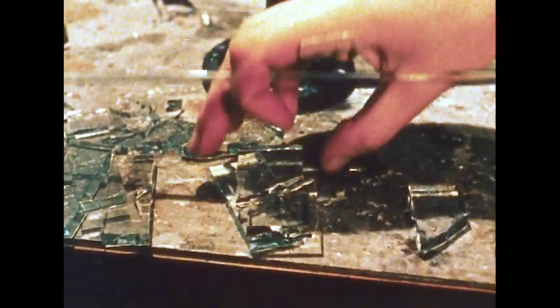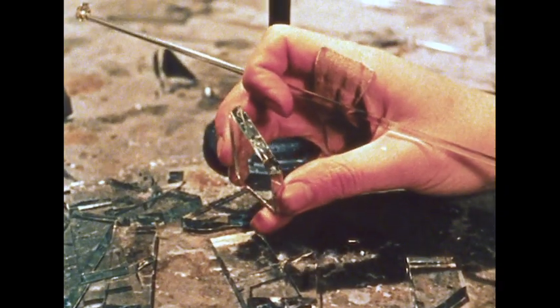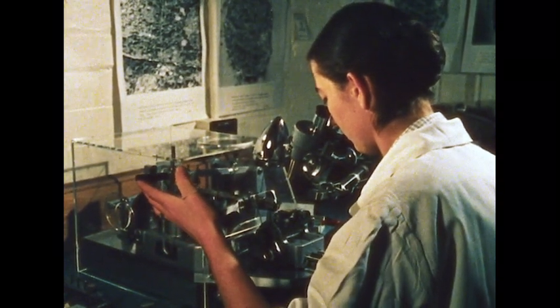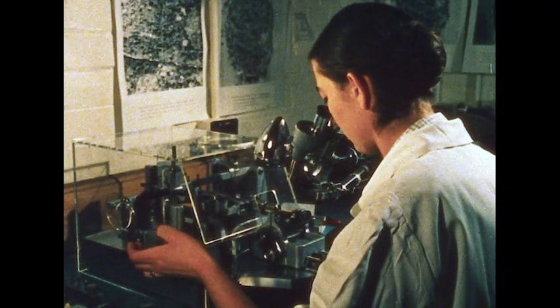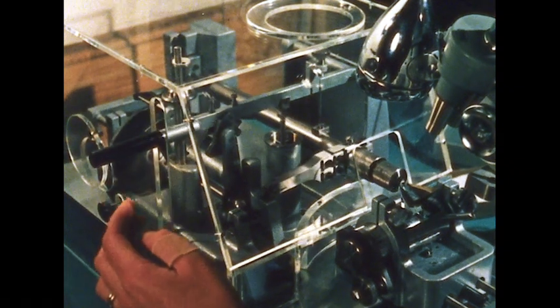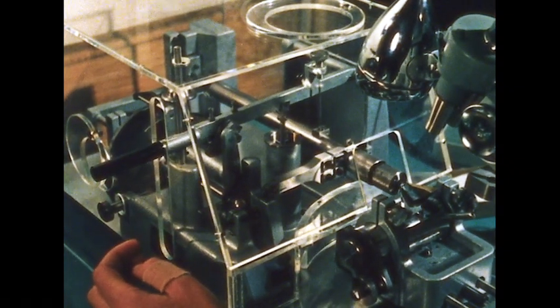A freshly broken piece of plate glass is one of the sharpest cutting edges known. It can be used to shave off sections of plant and animal tissue so thin that an electron beam will pass through them. The cutting instrument is called an ultramicrotome. The slices are 10 to 30 millionths of a millimeter thick. The thickness of a slice is judged by its interference color. Normally, the tissue is embedded in a plastic support.